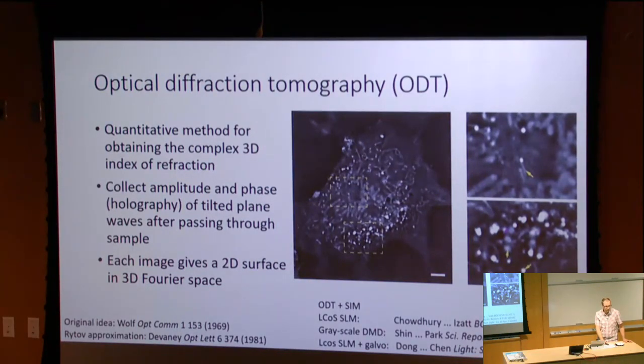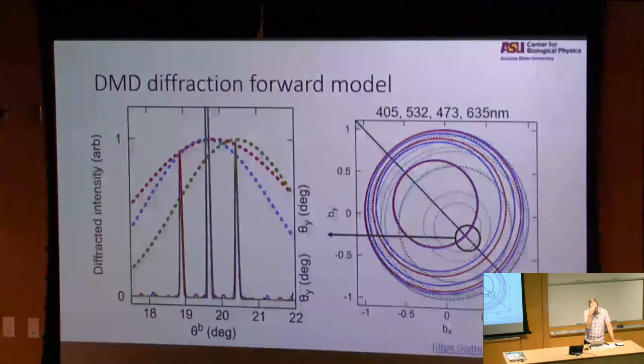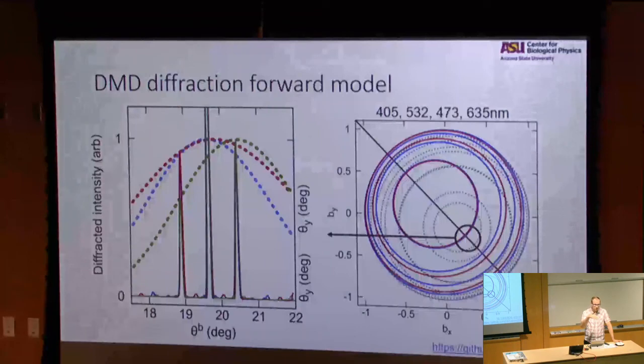You mentioned the shift in the green, but I don't remember if you mentioned how you bypass that and why it doesn't matter that much in the end. In the green, right. What it comes down to is this offset is in the electric field. Once you square it to get the actual intensity that shows up, it's not a big difference. It does bring the modulation depth slightly lower for the green than for the other two beams, so we lose a little bit of modulation depth.